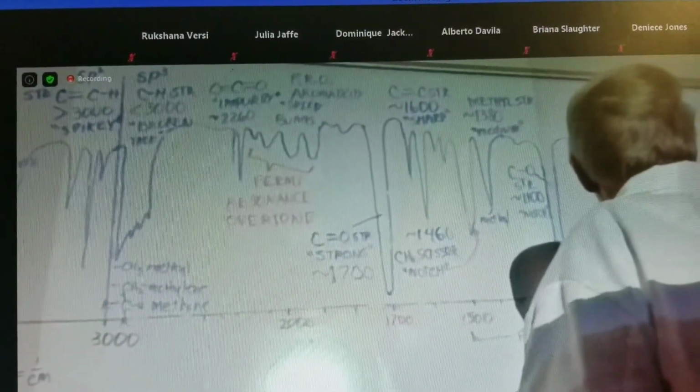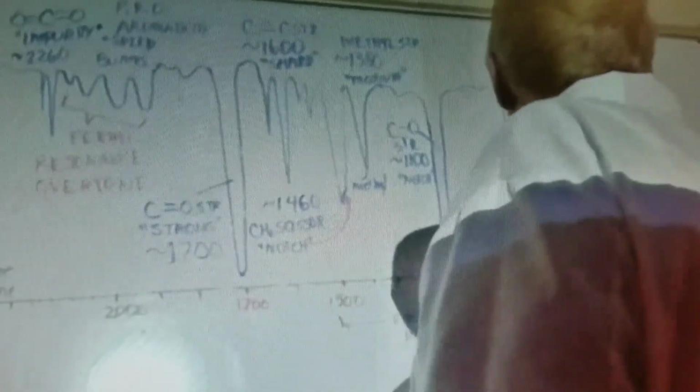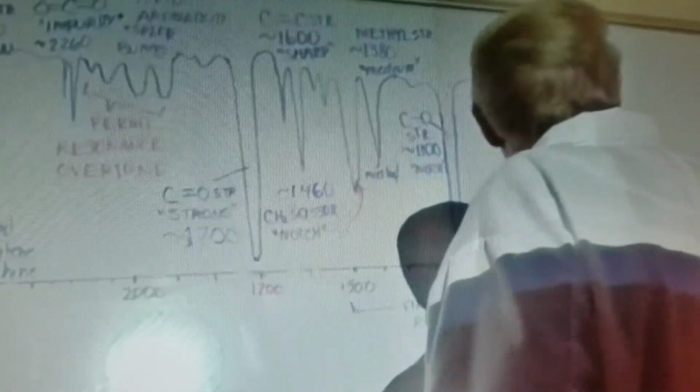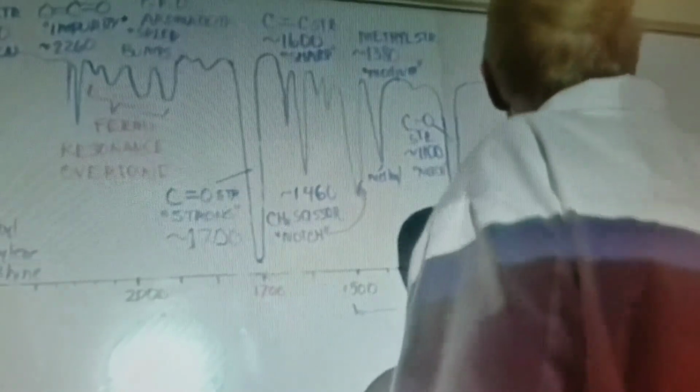Like that. And then you have another one about right there. And many times these things are conjoined. They kind of run together like this. Sometimes not. Sometimes they're well resolved. It just depends.